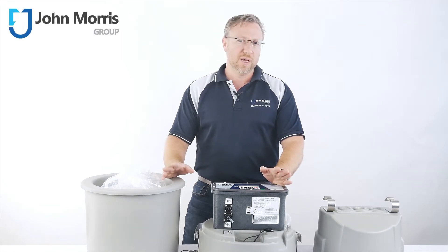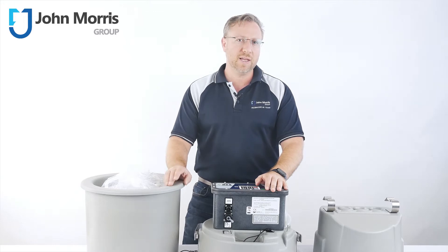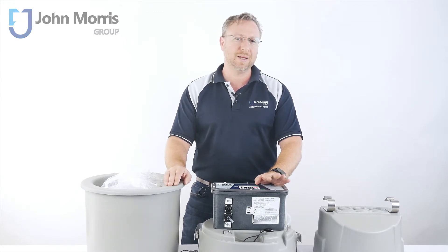Hi, I'm Andre from the John Morris Group. Stick around for the next 90 seconds to learn all the key features of the Teledyne ISCO GLS Composite Compact Sampler.